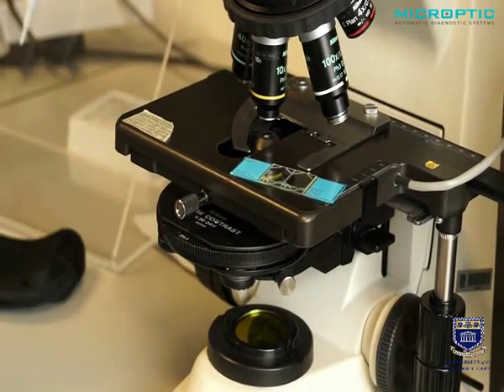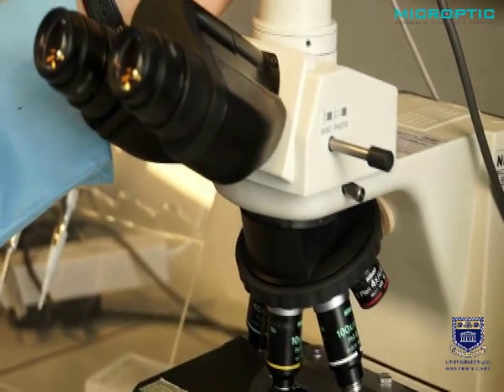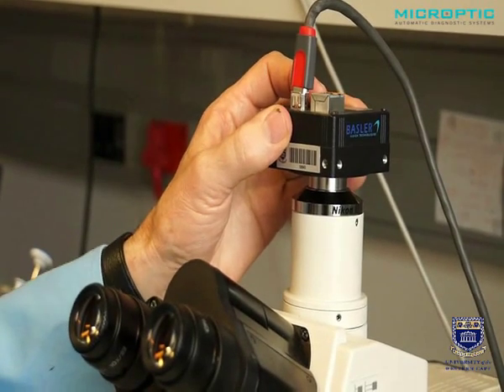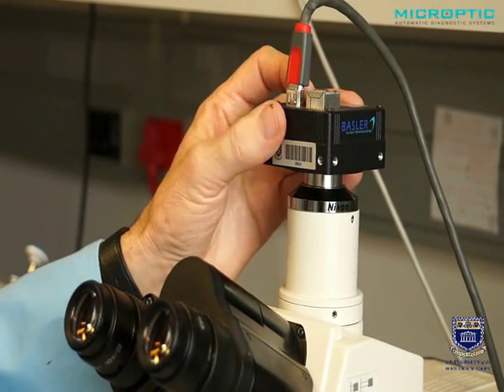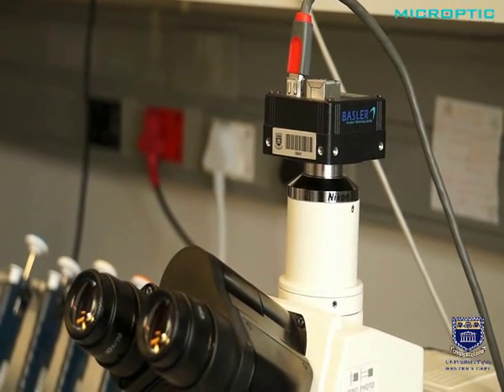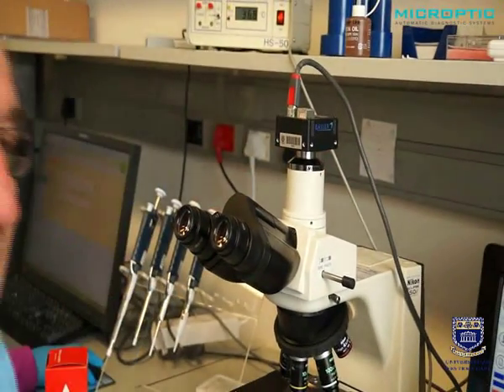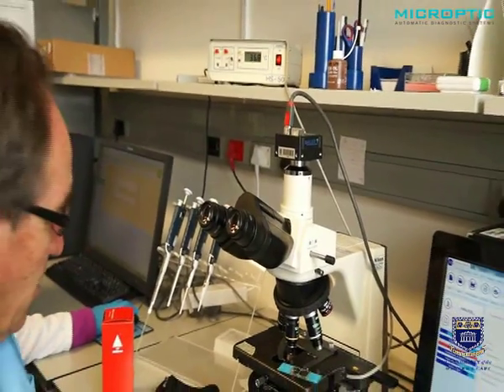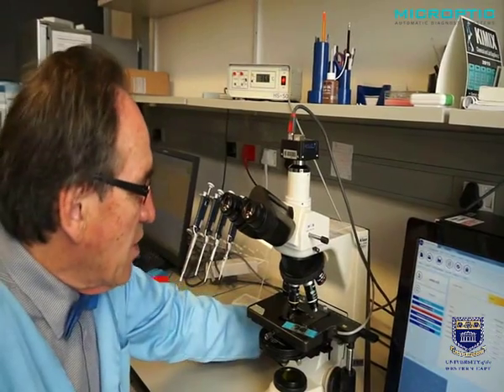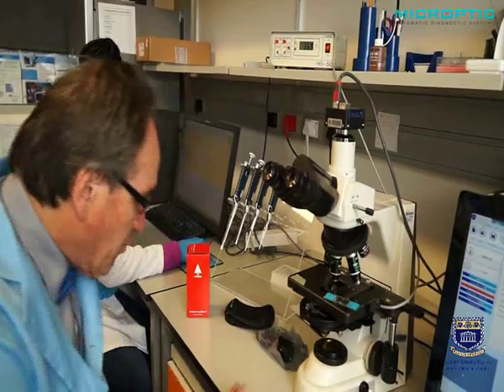The next step is that you require a really good camera with a sufficiently fast frame rate. Commonly we work with frame rates of 25 frames per second for most human work, but for hyperactivation studies of human sperm or sperm cervical mucus penetration, we need to work at least at 50 frames per second. There is a whole range of these fast frame rate cameras. They can go up to 100 frames per second.